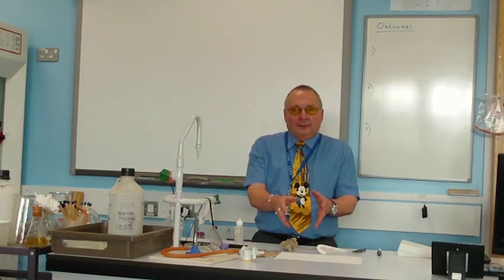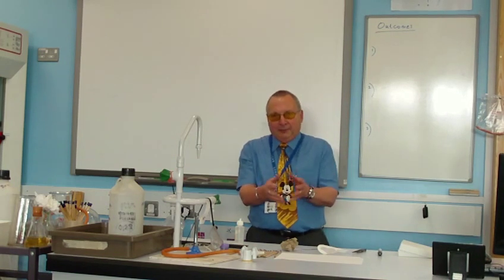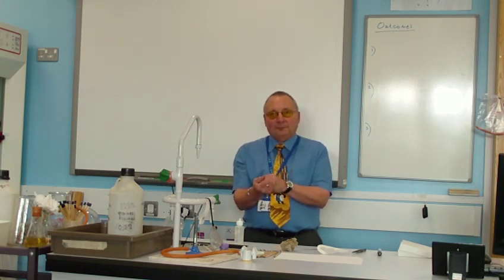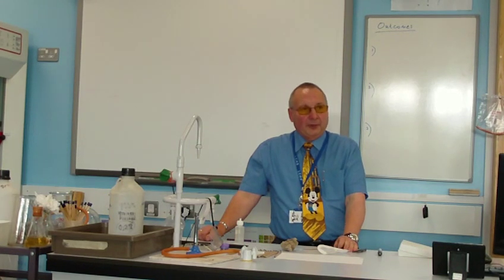Now, so what's this gas that metals react with? Well, these reactive metals react with water to produce this gas. What's it called? Begins with H. See if you get the right one. Hydrogen? Hydrogen it is, yes. And if you mix hydrogen with air, you get a pop.